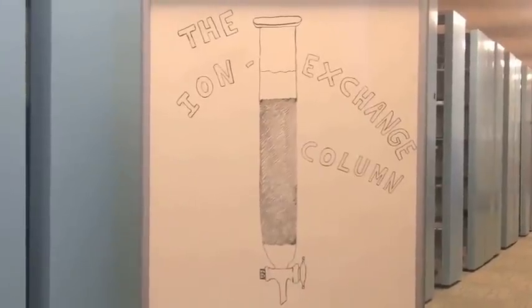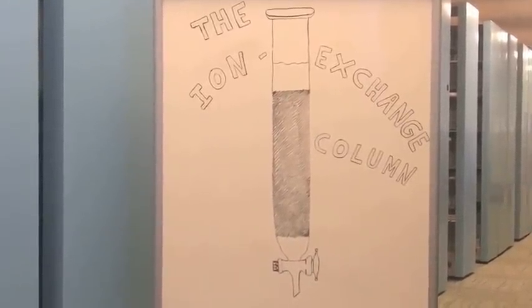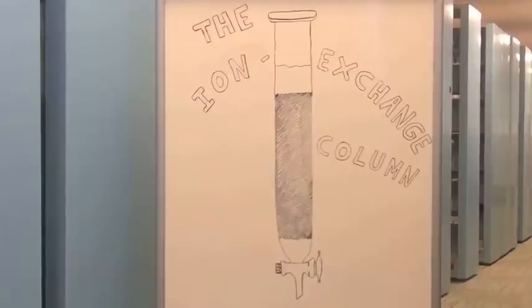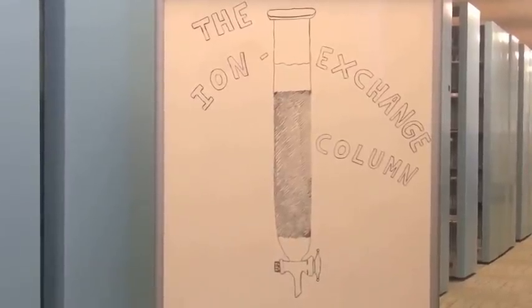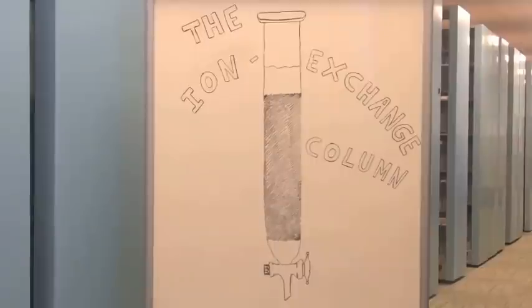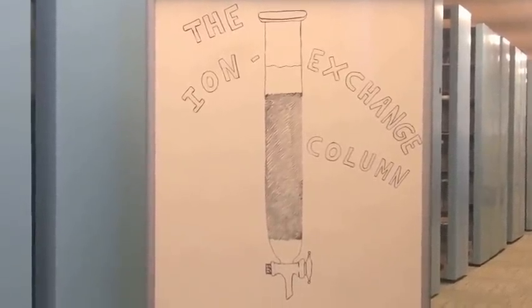Once you have this ready, get a ring stand and a clamp — use a distinct clamp rather than a burette holder, which you'll use later, because the column is much wider than a burette. Once set up, check the effluent of the column to make sure it's acidic: get a waste beaker, open the stopcock, and let a drop or two of the effluent run onto some litmus paper. The color should be pink, like this.